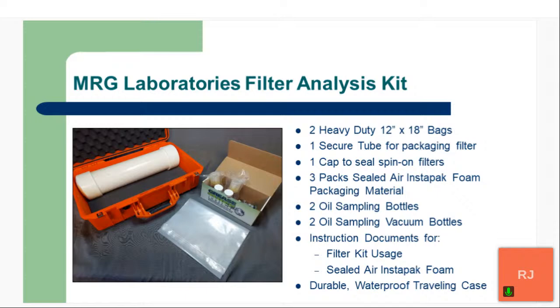So that made it a little bit harder to investigate in that situation. I can also think of situations in shipping where the container was not tight and all the oil that was in the filter was able to leak out. And then we got a dirty, oily box that had soaked up all the oil from the filter, and we had the filter with no oil in it. So we were able to do the physical inspection of the filter, but we weren't able to analyze any oil itself.